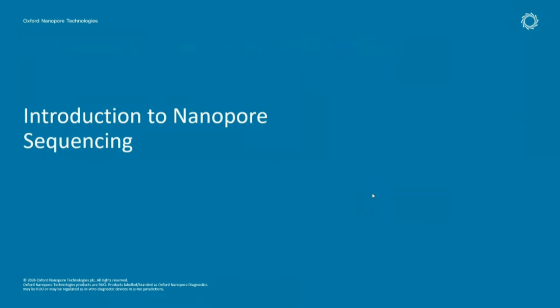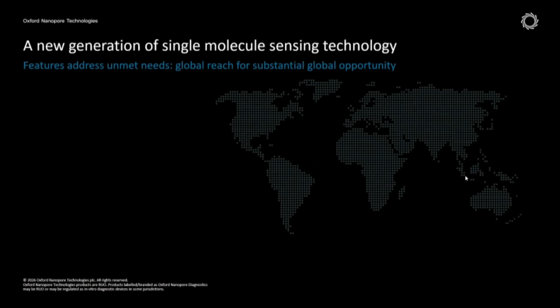So, nanopore sequencing. Let me introduce Oxford Nanopore Technologies. This is a UK-based company that develops and sells nanopore sequencing products, including the DNA sequencers, the MinION and the PromethION, and they also have solutions for sequencing DNA for different applications.